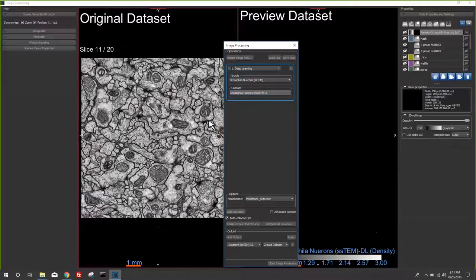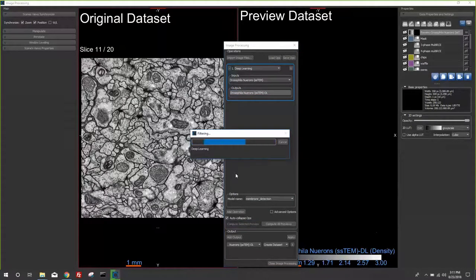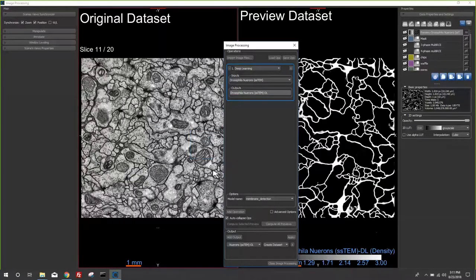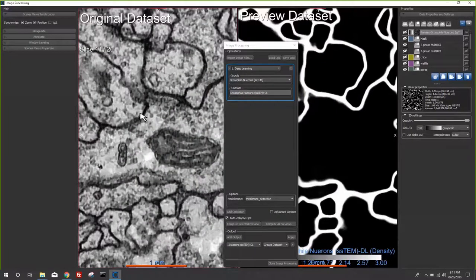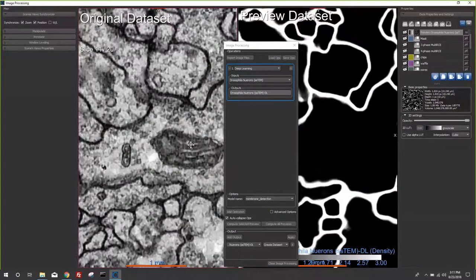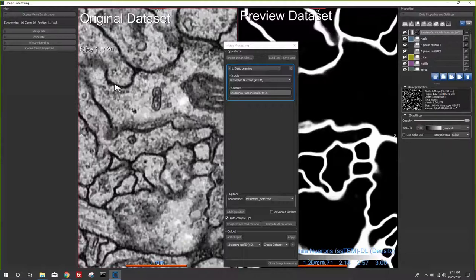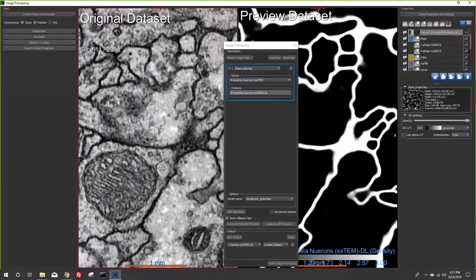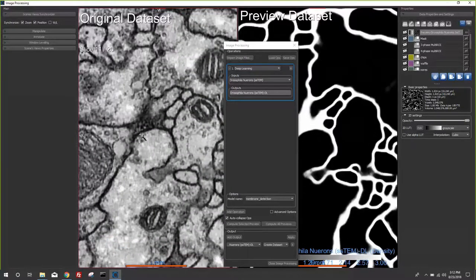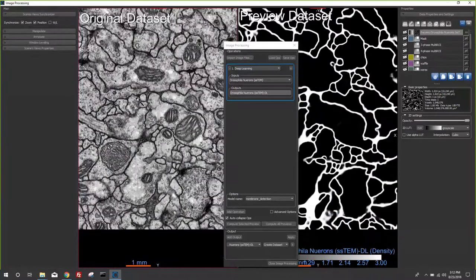One more example: Drosophila neurons using the membrane filter, the result of FusionNet described in the literature. In TEM sections, osmium contrast makes mitochondria, vesicles, and plasma membranes all appear dark — thresholding gets you nowhere. But by having manually segmented slices as training data, the software figures out where the plasma membranes are, giving you automated segmentation.